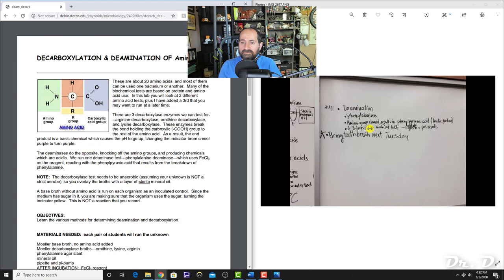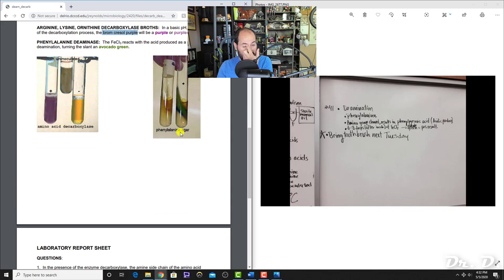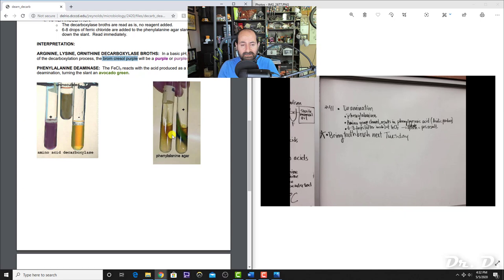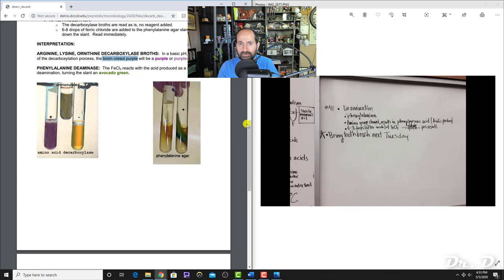To test for deaminase, add 6–8 drops of the reagent ferric chloride (FeCl3). If it turns avocado green, that's a positive result—deaminase is present. If there is no green color after adding ferric chloride, the deaminase was not present. Know that an acidic product is formed and the reagent is ferric chloride.